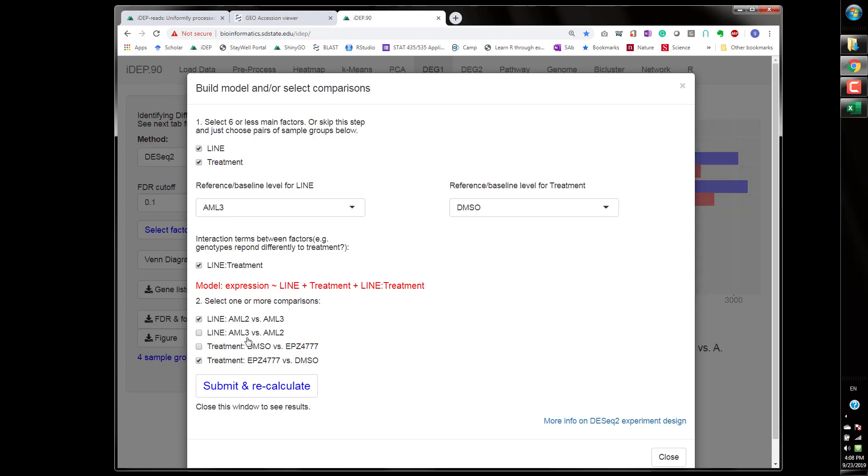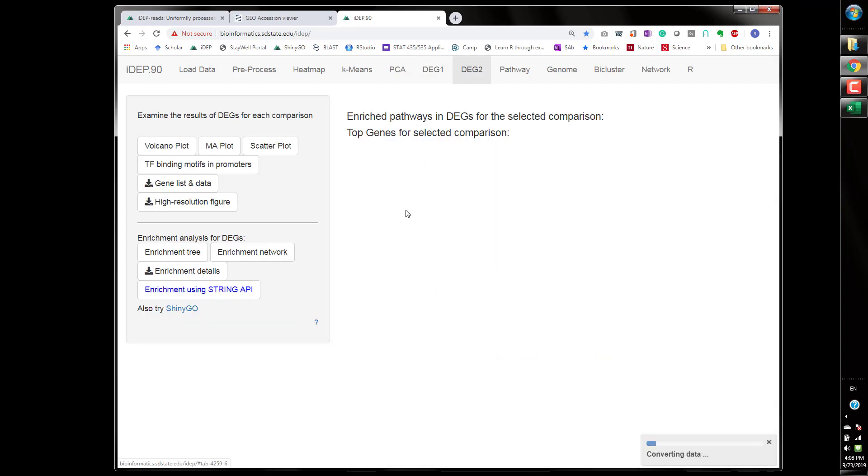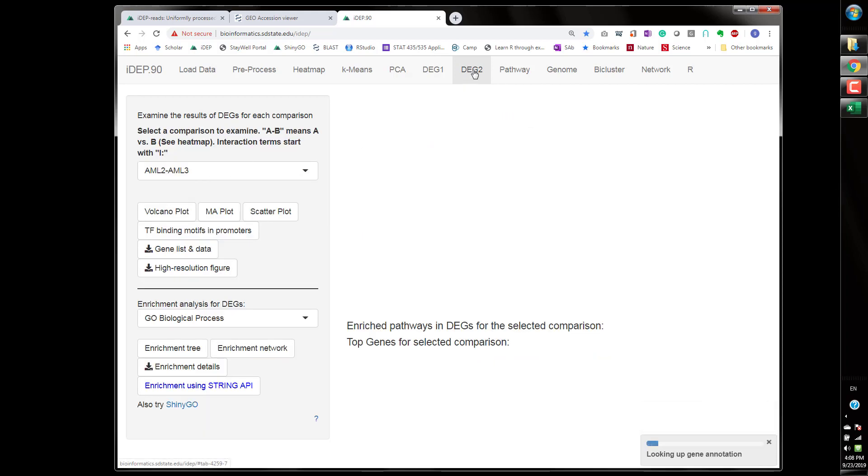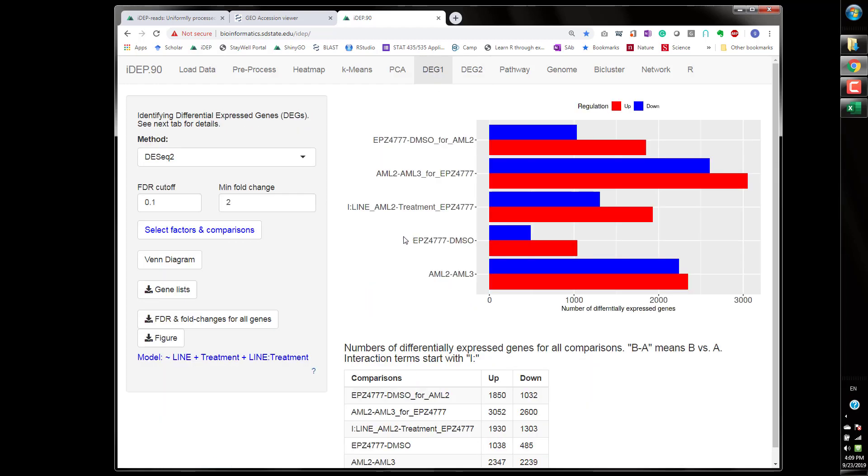So these comparisons just whatever you think makes more sense we recalculate and we have the results in here. So obviously we can investigate each one of the comparisons here in DEG tab and here the AML2 versus AML3 was difference in baseline without treatment. The difference between ML2 and ML3 the cell lines obviously there's a lot of difference between these two cell lines even in baseline, thousands of genes are expressed differently.